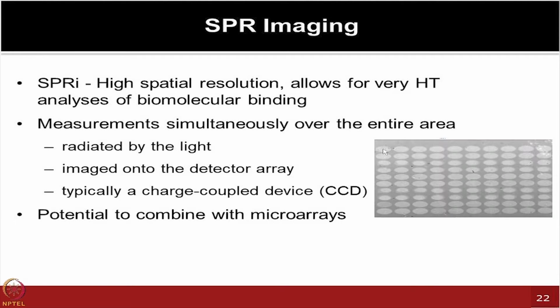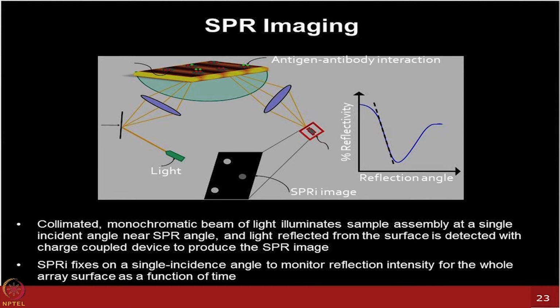So, this is one of the images I am showing from one of the experiments I was doing in Josh lab earlier when we were developing some SPR imaging based platform on the early prototypes. As I mentioned to you, you are seeing just the pseudo image. You are not measuring fluorescence. These are some of the pseudo images obtained from this kind of platform which shows you compatibility with SPR imaging.